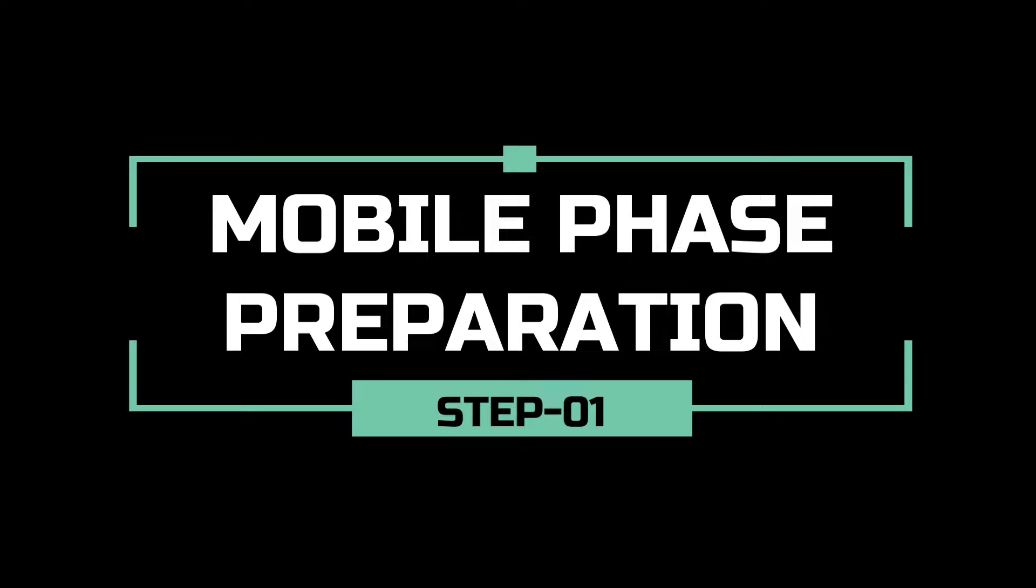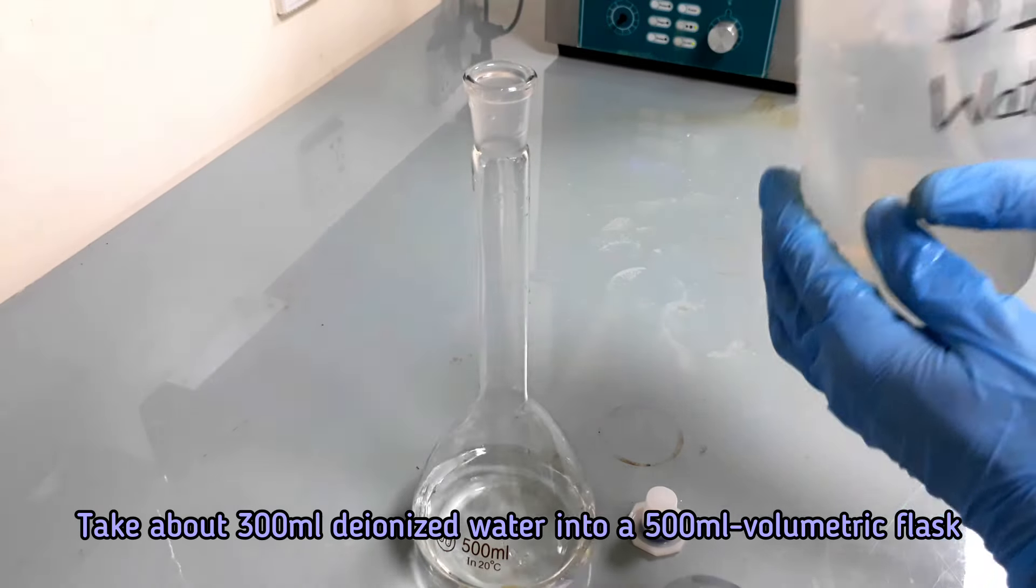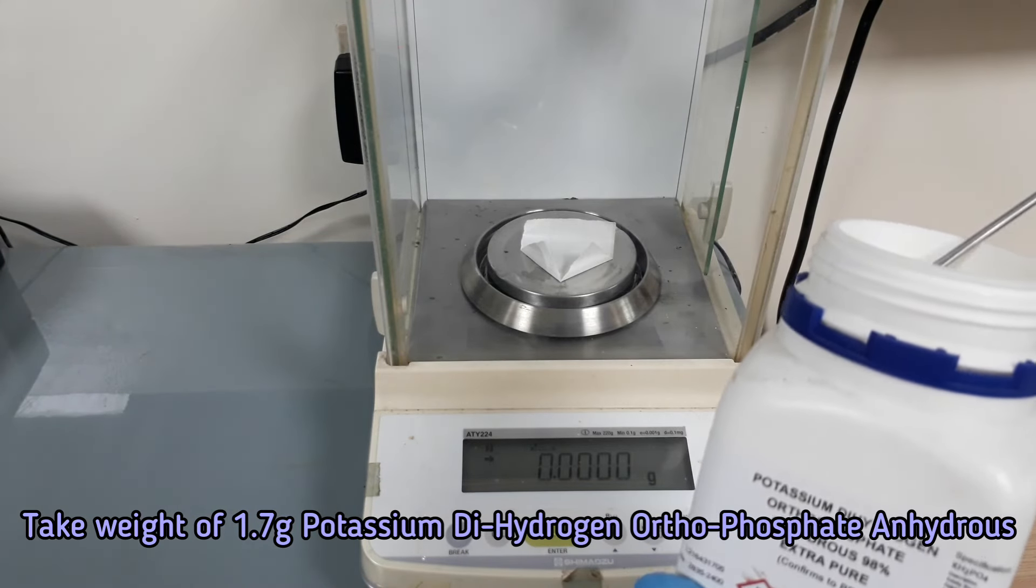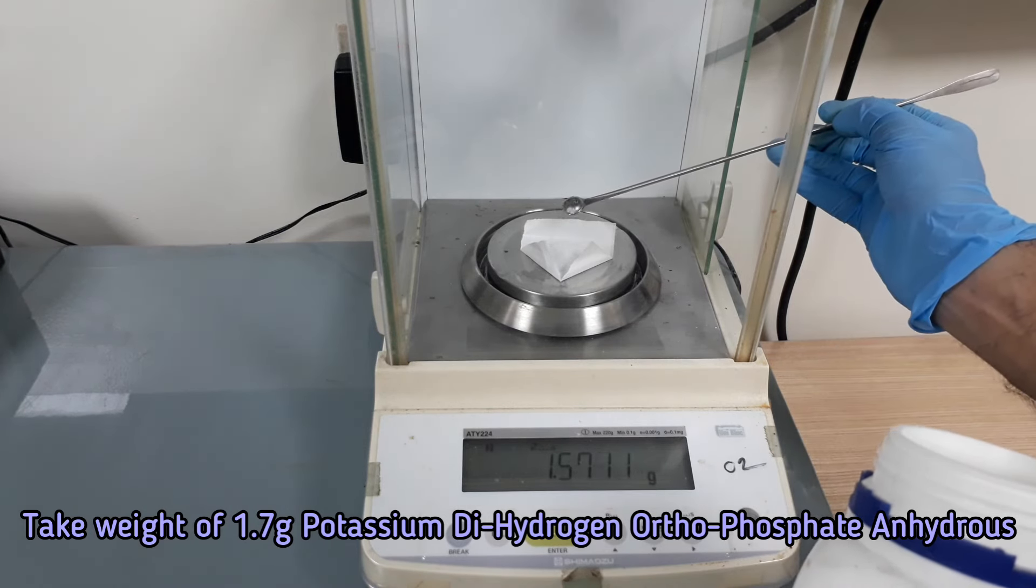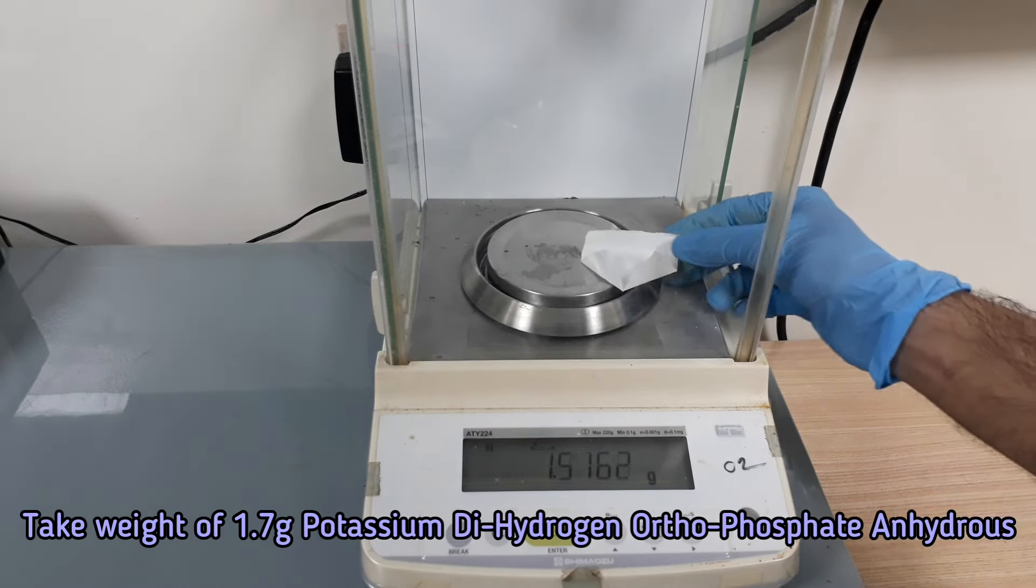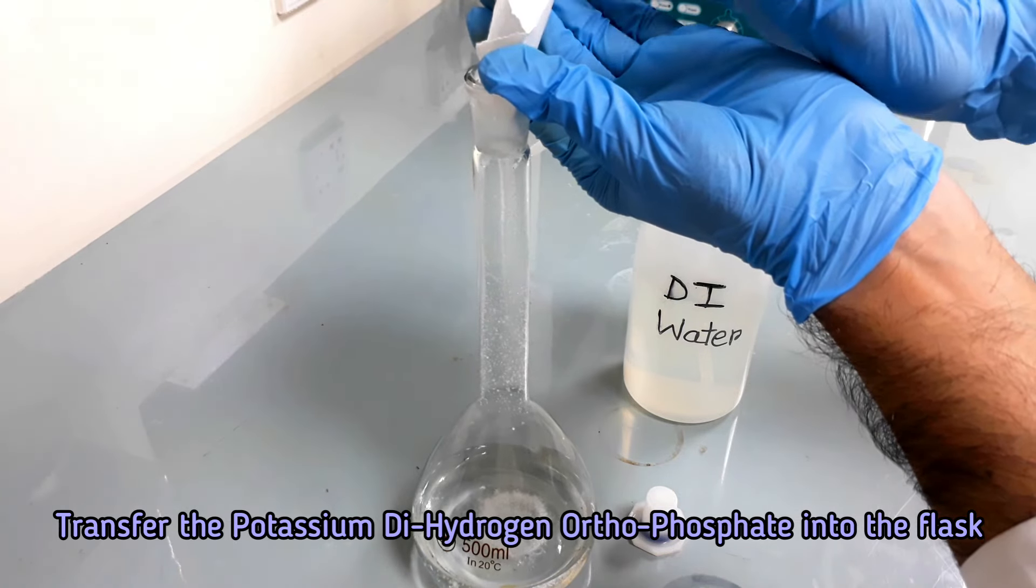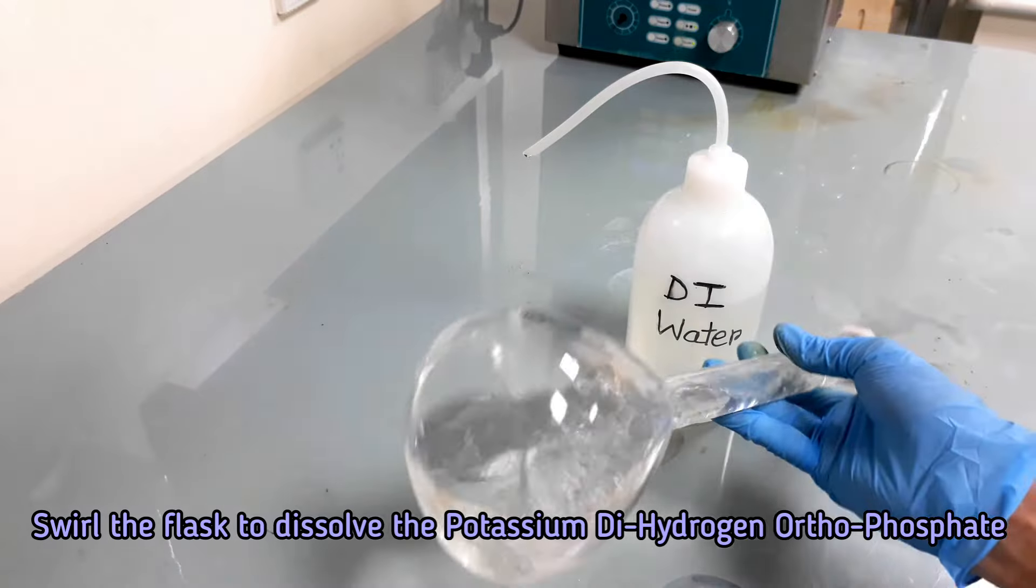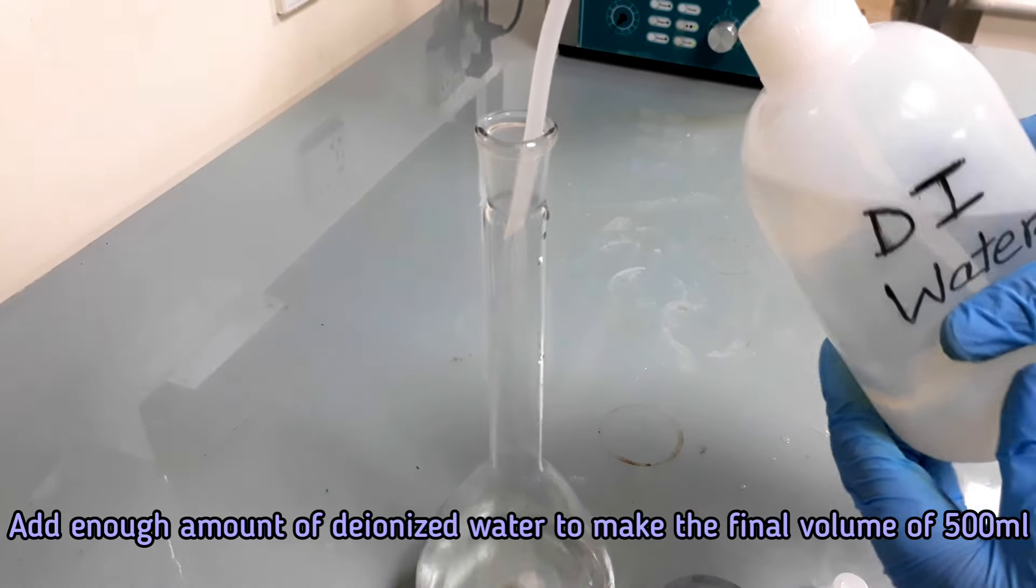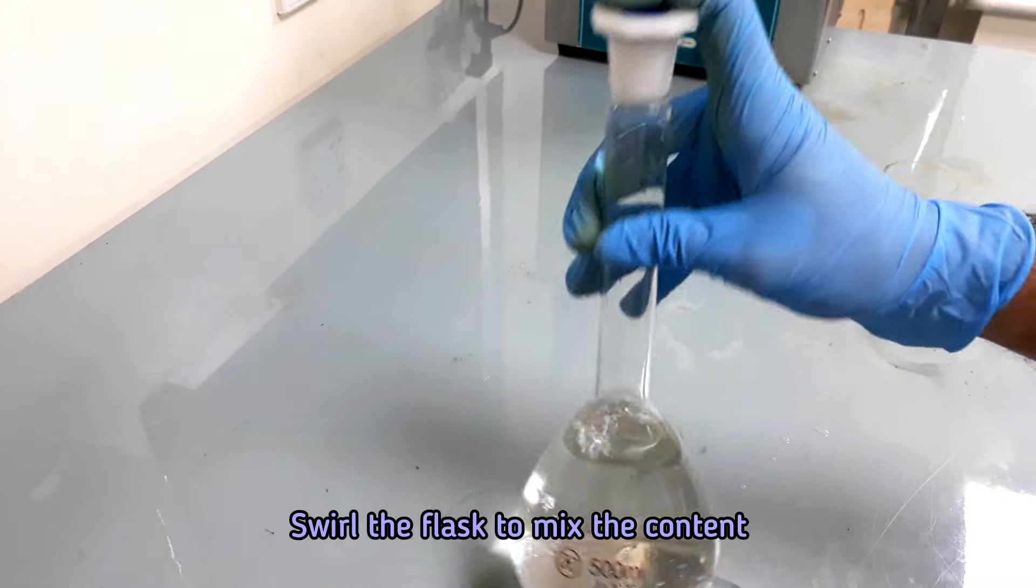Let's prepare the mobile phase. First, we are going to prepare mobile phase A. Take about 300 ml deionized water into a 500 ml volumetric flask. Take weight of 1.7 g potassium dihydrogen orthophosphate anhydrous crystal. Transfer the potassium dihydrogen orthophosphate into the flask. Add enough water to make the final volume of 500 ml. Shake the flask to dissolve the chemical completely.